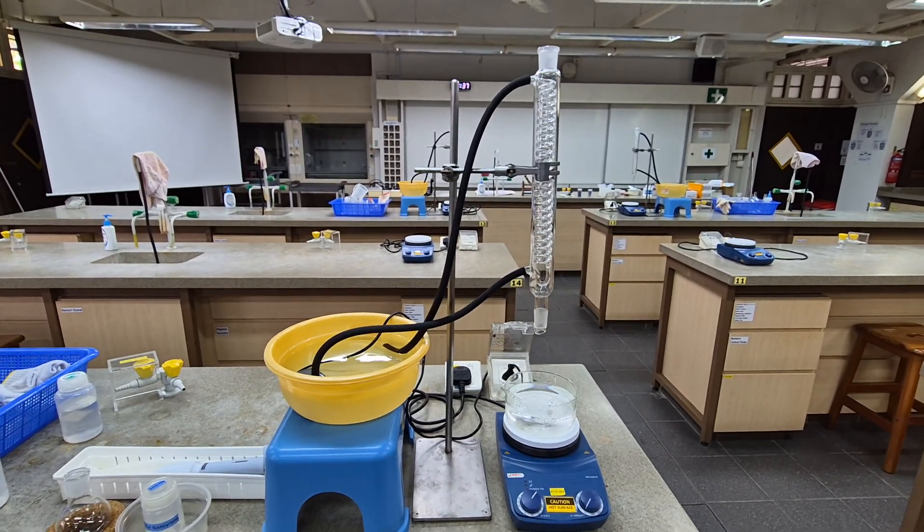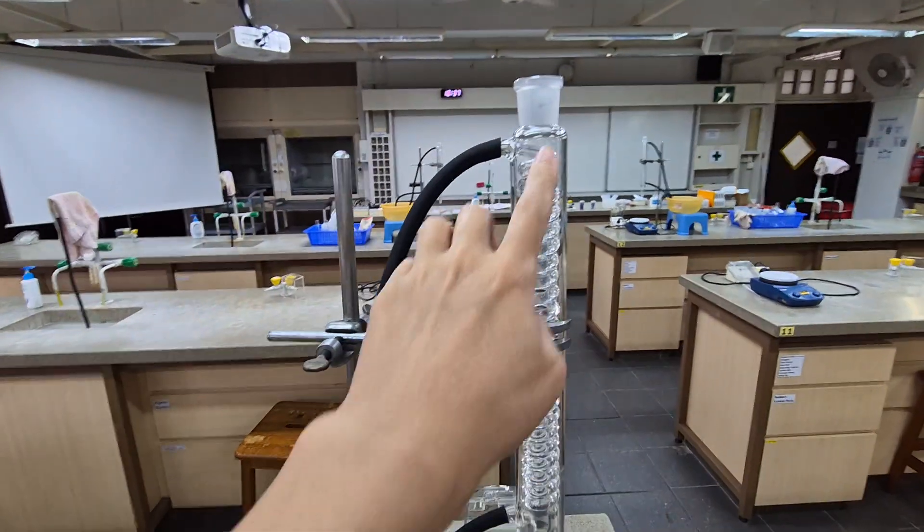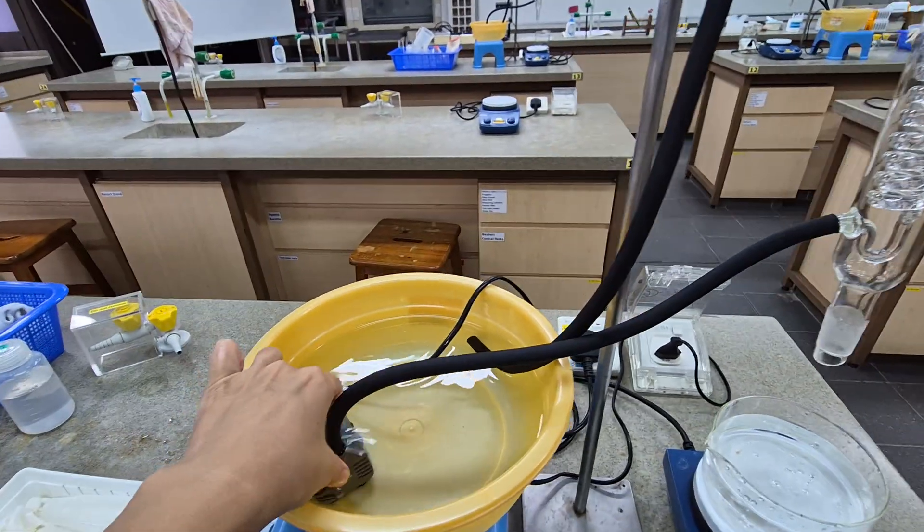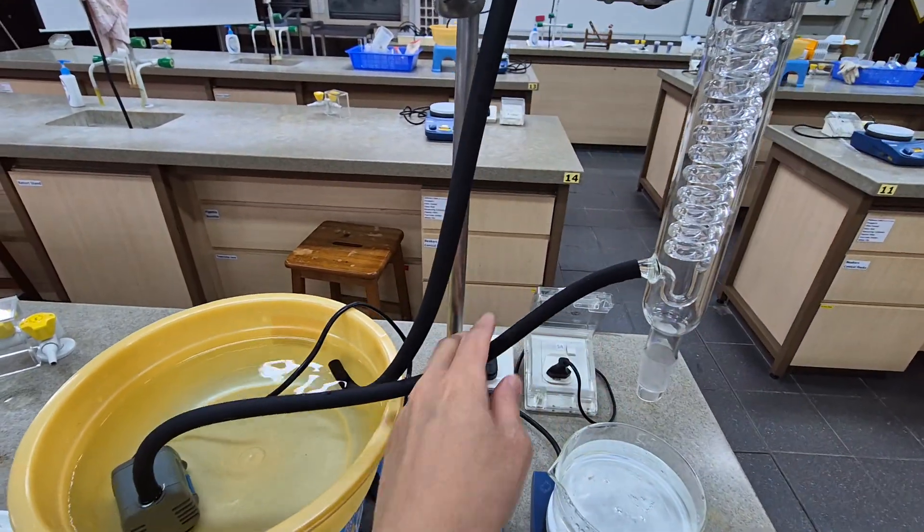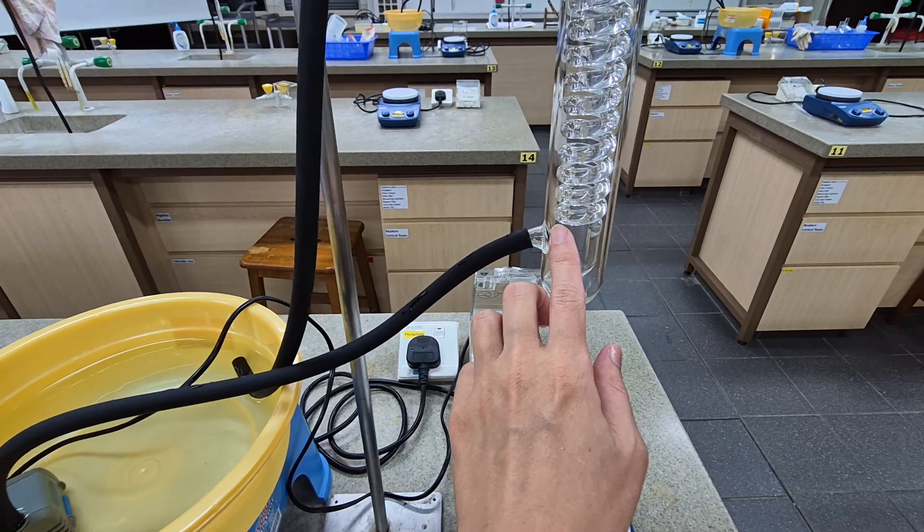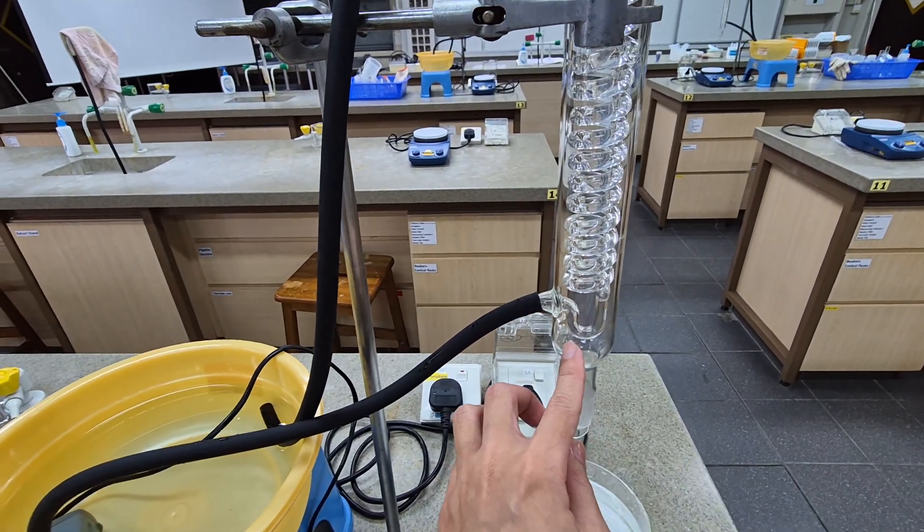This is the reflux setup without the round bottom flask. This is the reflux condenser. We have a fish pump here to pump in water, so the cool water will enter from the bottom. The reason why the cool water needs to enter from the bottom is because during reflux when the solvent and the reactor evaporates, it would be best if they touch the coldest parts of the condenser first.